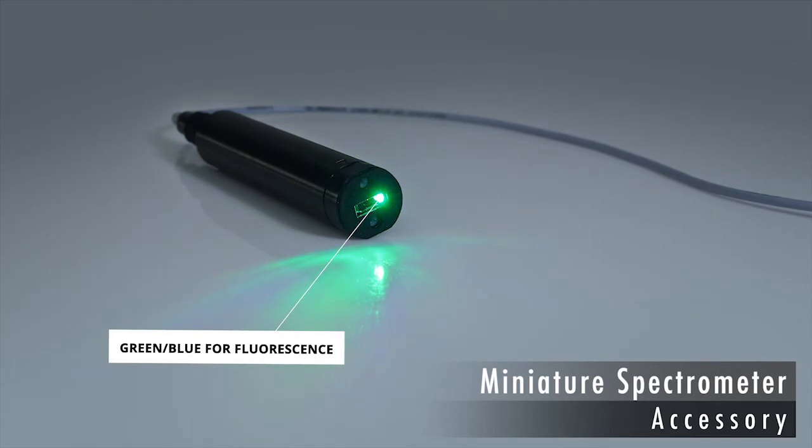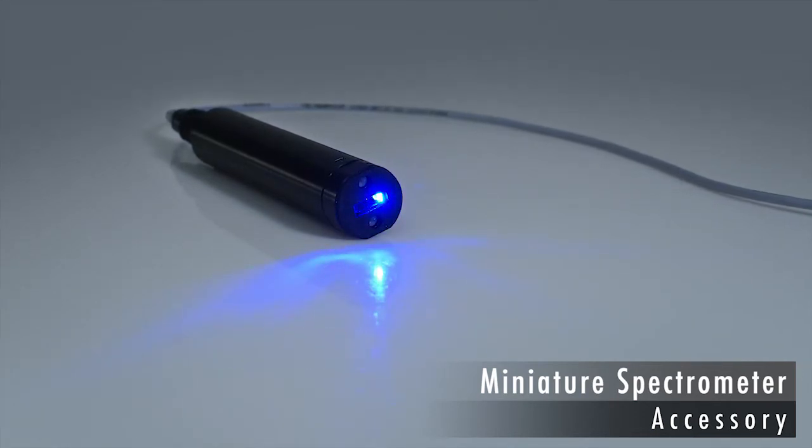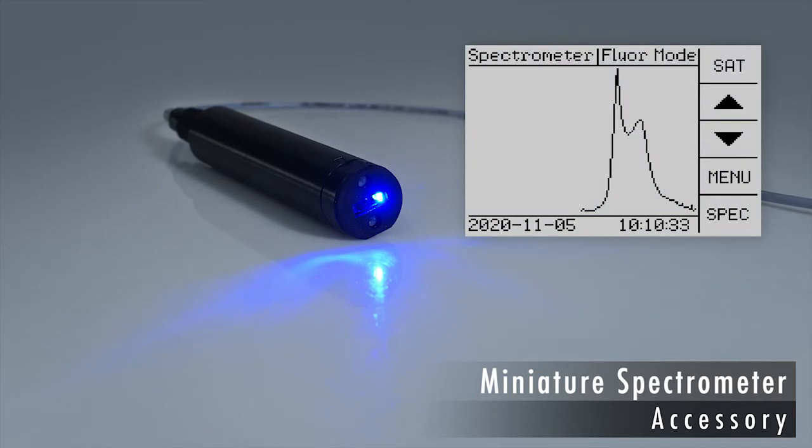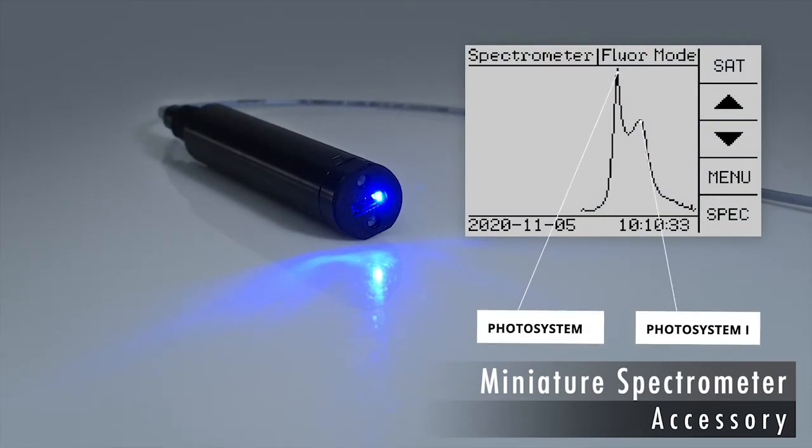A green or a blue light source is used for fluorescence emission spectra. The peaks in fluorescence emission spectra can be assigned to photosystem 1 and photosystem 2.